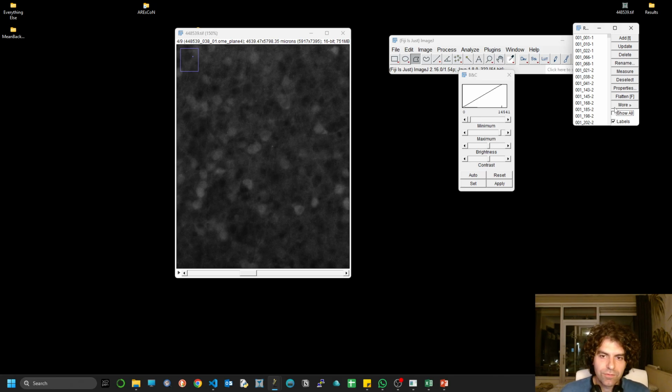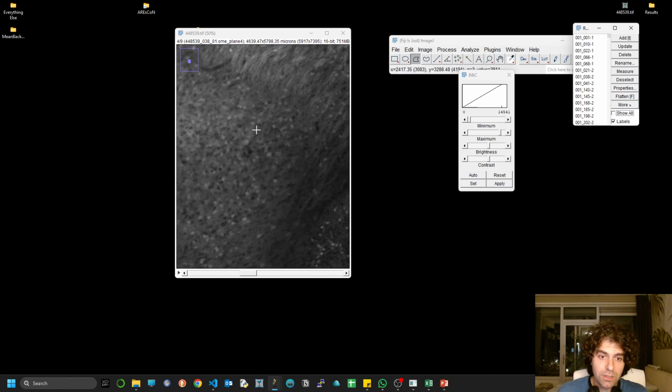And then you can have observations of neurons that were expressing both CFOS and the tomato, for instance. That's going to be done very, very soon.